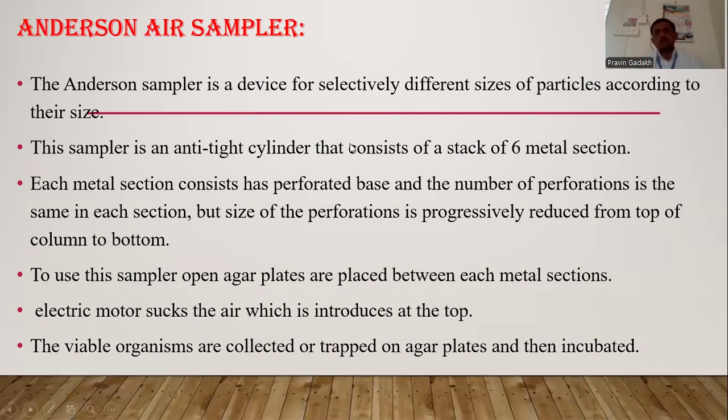In the last lecture, we discussed another sieve sampler, which is the slit type of air sampler. Now, in this lecture, we'll discuss the most important air sampler, the Anderson air sampler. The name itself suggests it was designed by the scientist Anderson.